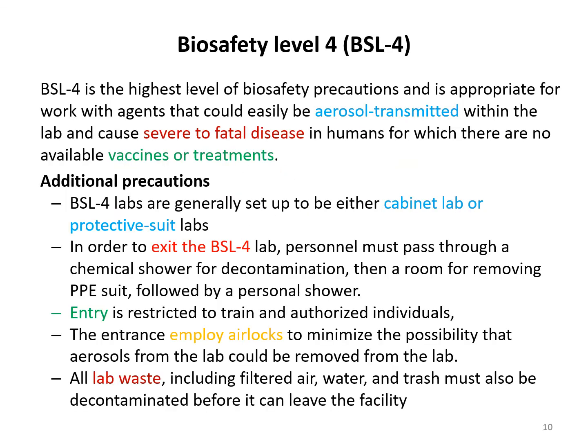The last level of biosafety is number 4. The pathogens that fall here are more severe, and definitely they can cause severe disease, and also fatal diseases in humans. And for this level, no vaccination or treatment is available.